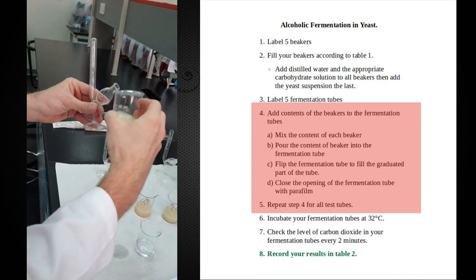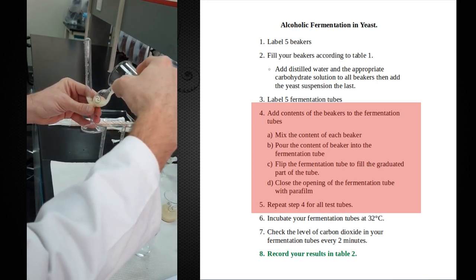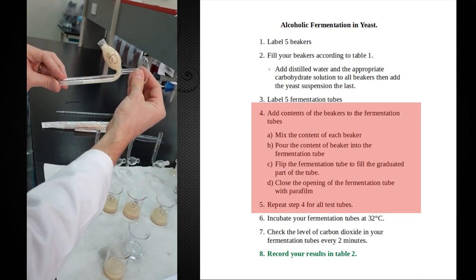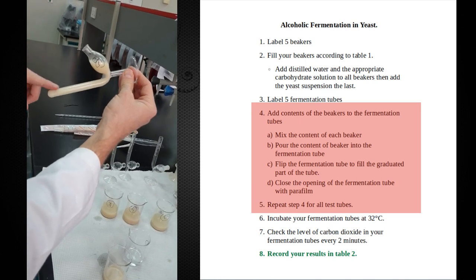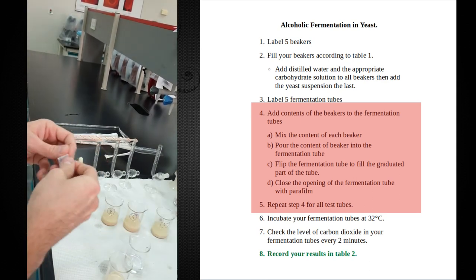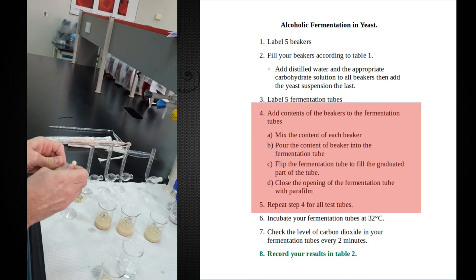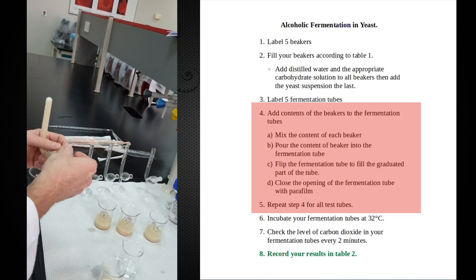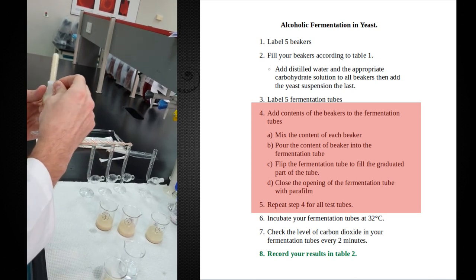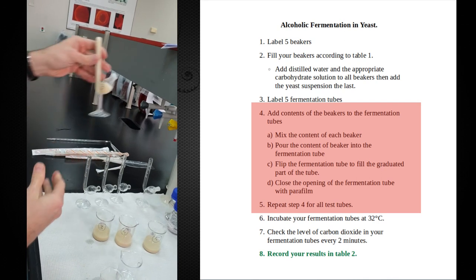Here's number two, my second negative control. Again, mix it up, and then I'm going to pour it in here. I'm going to fill it as much as I can. And again, turn. Let's make sure there's no more air in here. Then seal it off with some parafilm. It's got to stretch to be able to stick to the glass, and the glass needs to be clean and dry. So if it's not dry glass, you need to make sure that you dry it off first. Make sure it's nice and tight. So here's our sample two.